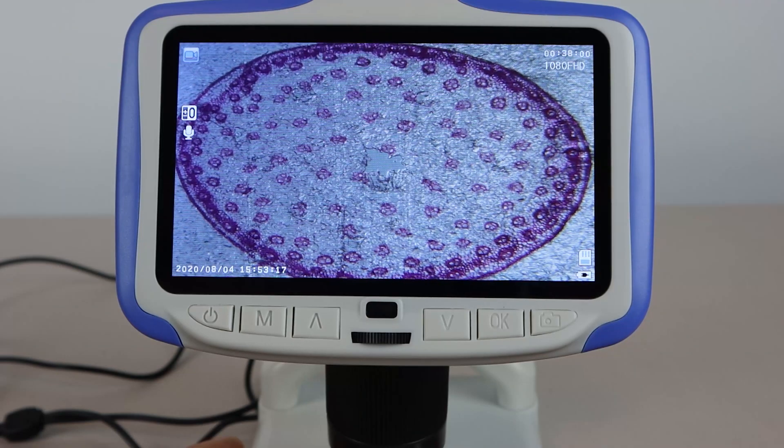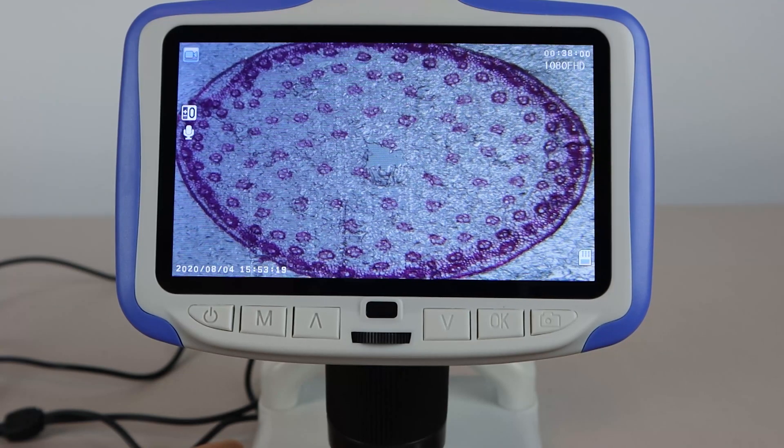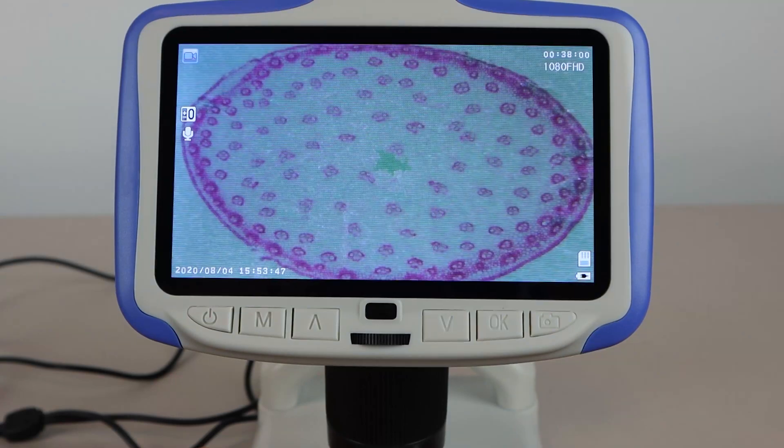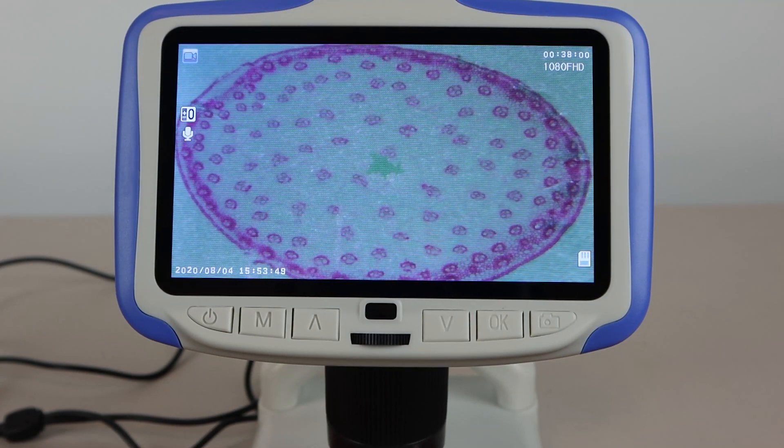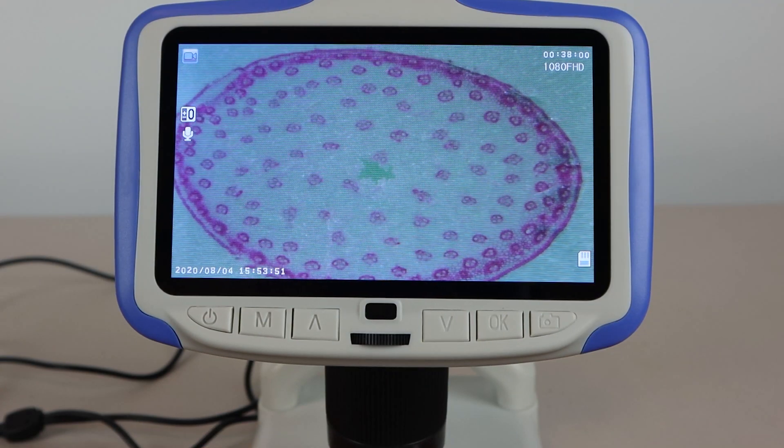Not only would this be a fun and educational tool for kids to use and learn from, but it can also be used for practical examination of small objects or electronics repair.